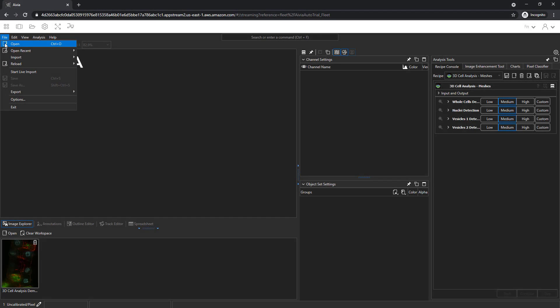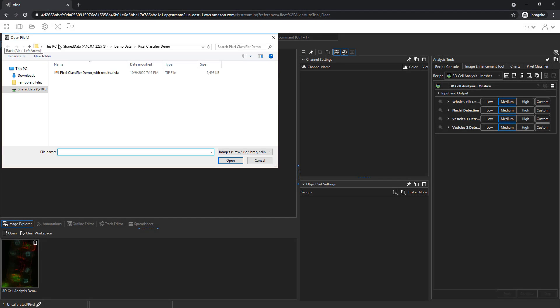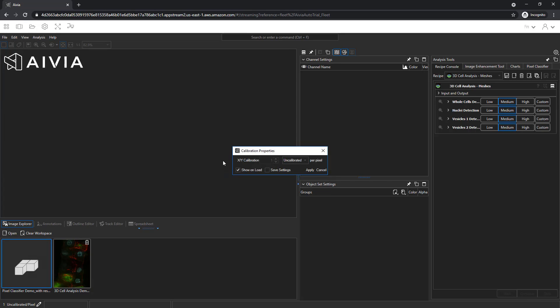Go to File, Open. In the Demo Data Pixel Classifier Demo Folder, select the image and click Open.